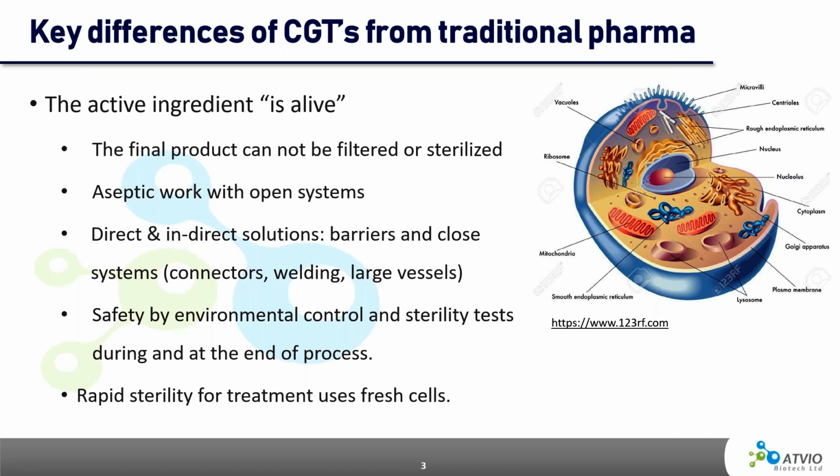On the direct level, we mean we want to close the system as much as possible through the process, by elements of sterile connectors, or using welding to connect tube to tube, or even in a simpler manner, just instead of using a lot of small volume vessels, going into one large single vessel. This will also reduce the amount of openings that we currently have in our process.